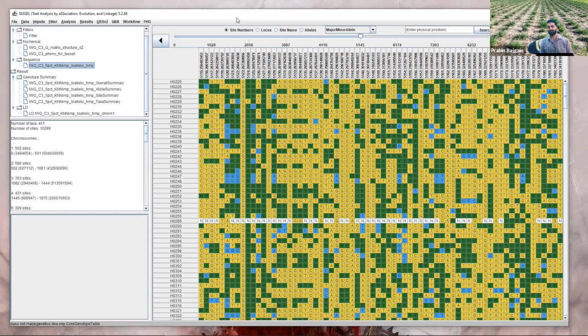Or they're so close to each other that they're essentially zeros, and I do not know if it does zero or skips that value. I'd probably have to look into that and get back to you. Actually, I've just taken it at face value that if it doesn't calculate, then I trust what TASSEL does, so I'm not going to worry about it. That's been my thinking. That's a good point. Okay, thanks.